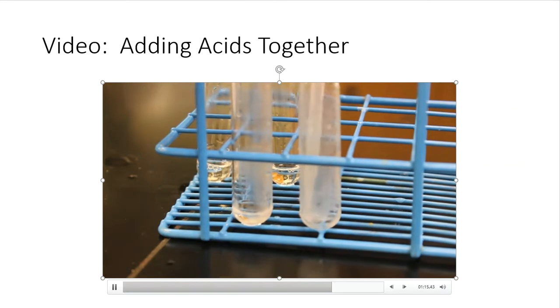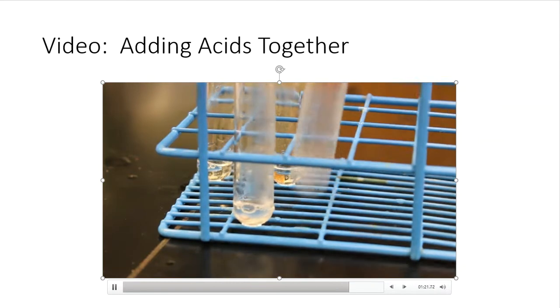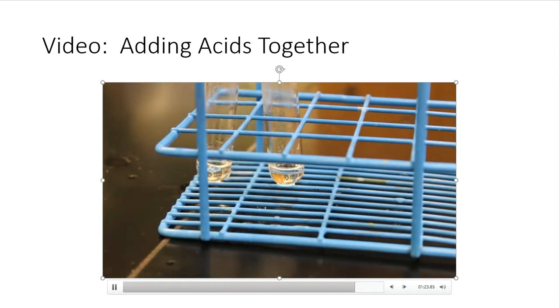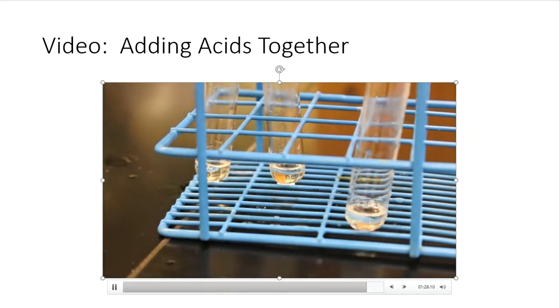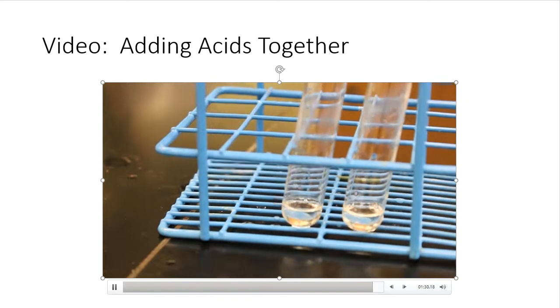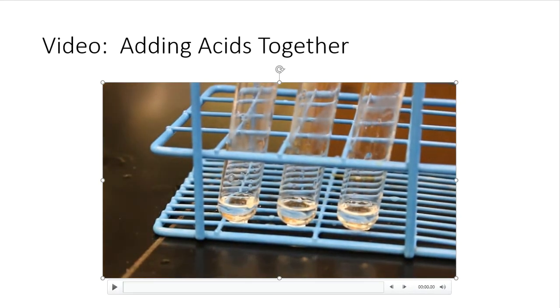So they like for you to keep this cold because it does generate quite a bit of heat. Anytime acids, especially nitric and sulfuric, are used with some water or in basically organic reactions, you're going to start to see a lot of evolution of heat, a lot of steam that can be generated and so forth. So that's why they told us to keep it cold. It's still cold to the touch, and it did not warm up when I added these 2 things together, at least not substantial enough for me to notice it.